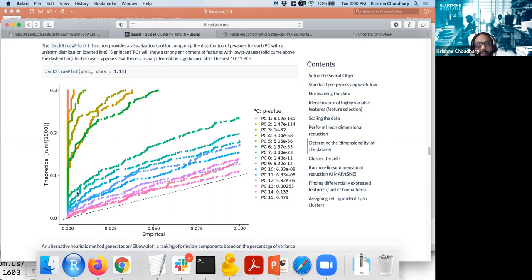And that is the kind of information that is also given in this plot here, along the x-axis and the y-axis. What we have is, from a permutation-based test, the p-value for the genes. Each dot here is a gene. And on the y-axis, it's the expected value.